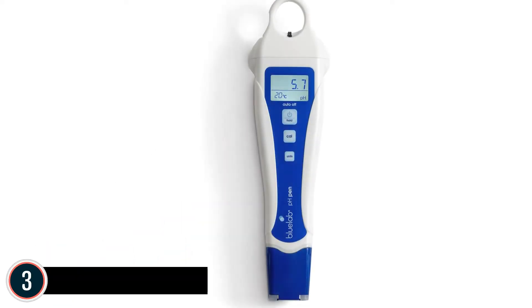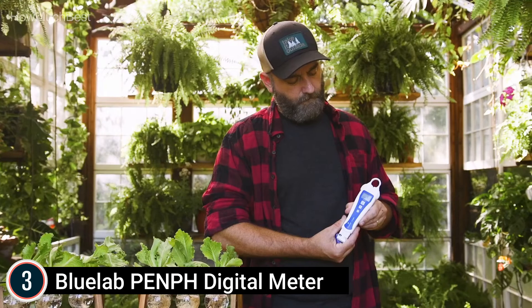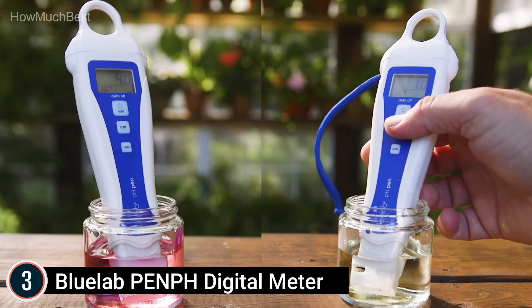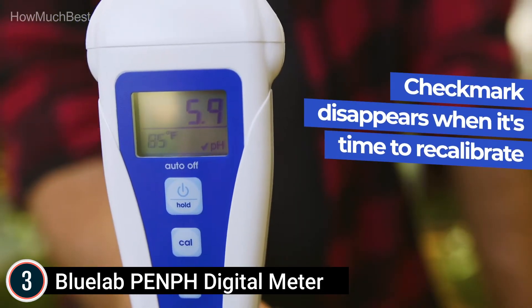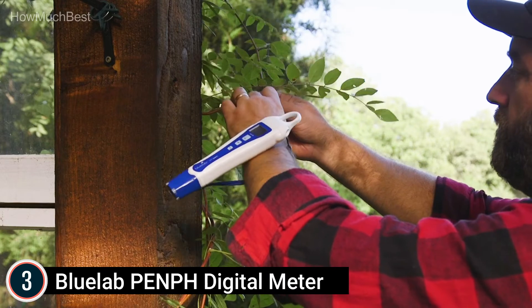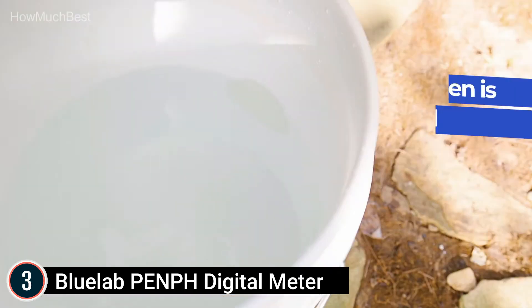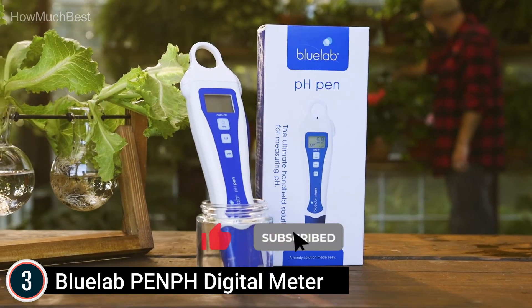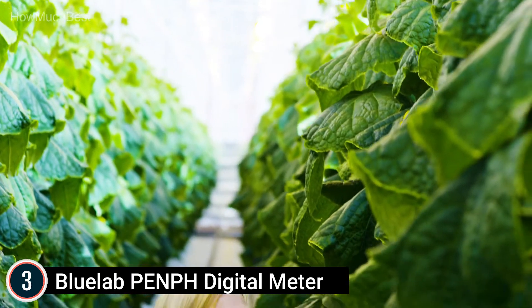Item number 3: Blue Lab PEN pH Digital Meter. It measures pH in nutrient solution, acid or alkaline, for precise adjustment with a lab-quality glass probe. General uses include growing tents, swimming pool, drinking water, fish tank, and brewing. This hydroponics tester has ATC that provides consistent readings despite fluctuations in temperature, a calibration reminder, a long-lasting design for repeated use, and is fully waterproof and floats. The double-joint electrode has a longer lifespan compared to typical probes due to less contamination, and is more precise and reliable than similar pens, test strips, and drops.